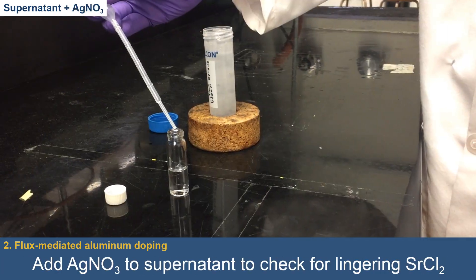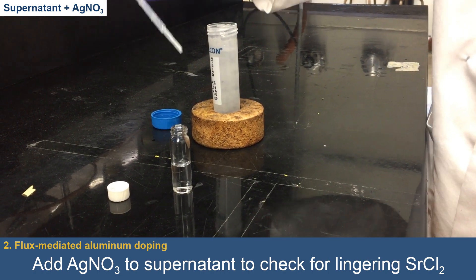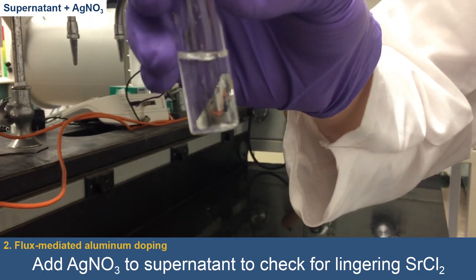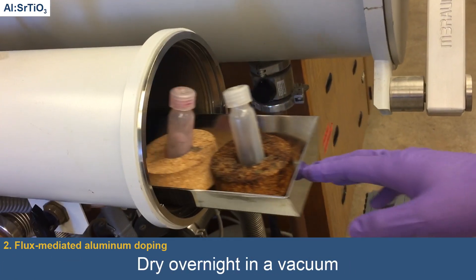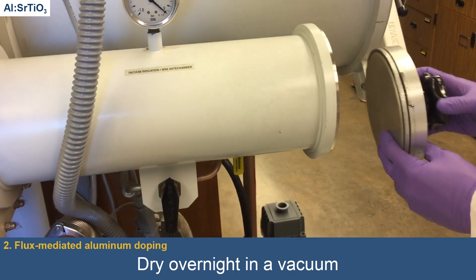To the final supernatant, a few drops of silver nitrate are added, and the absence of silver chloride precipitate confirms there is no lingering strontium-chloride in the aluminum-doped strontium-titanate powder. The clean aluminum-doped strontium-titanate powder is then left to dry overnight in a vacuum.